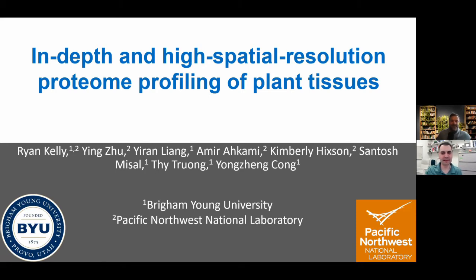Yeah, so we'll be talking about in-depth, high spatial resolution proteome profiling, trying to directly develop maps of protein expression across tissues. And a lot of what I'll also be sharing was developed in mammalian cells, but I promise there will be a bit of plant cell data or plant tissue data at the end of the talk. So bear with me.